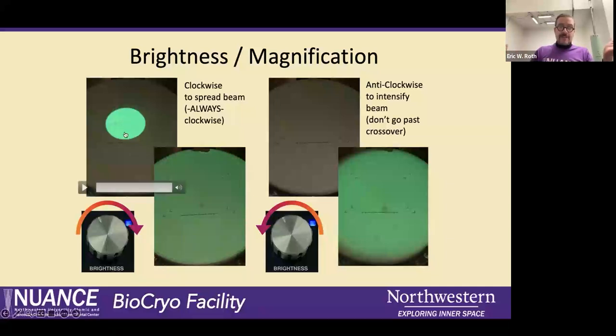You can imagine here, if this beam, see how much more intense that is hitting the camera, we do risk damaging it. So, I have a rule on the 1400, but this should apply to pretty much all the microscopes, right? If you're going down in magnification, it's very, very important: make sure you lower the phosphor plate first and readjust your beam so that you're not hitting the detector too intensely. We can damage that.